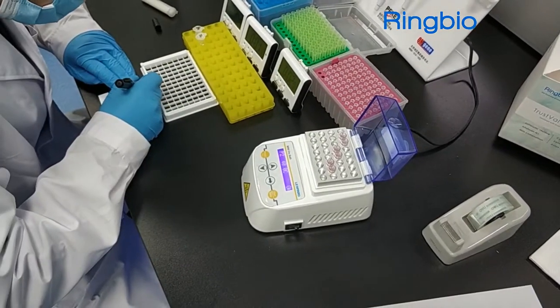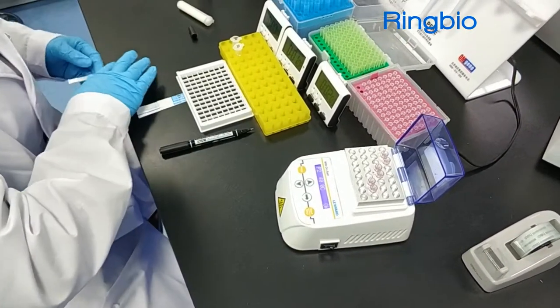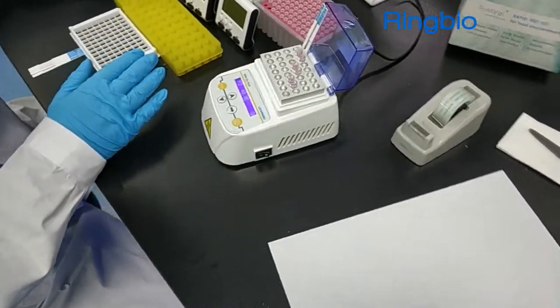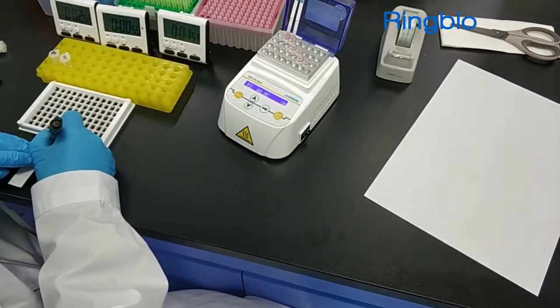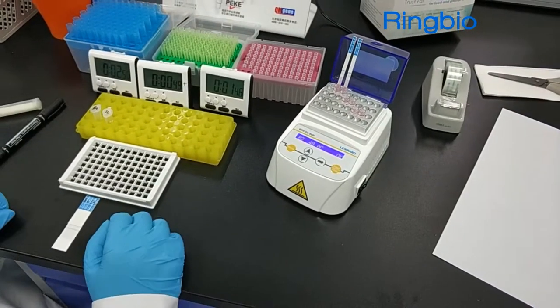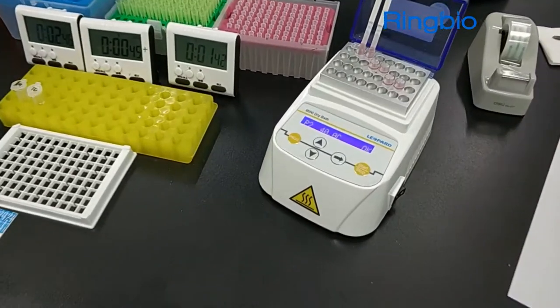After the first 3 minutes incubation, we take out the test strip and insert it into the wells so that the test sample can flow on the strip. Make sure the dip end on the strip is dipped into the wells. And then incubate it for 3 minutes at 40 degrees centigrade. You can see the milk is climbing quickly on the strip.